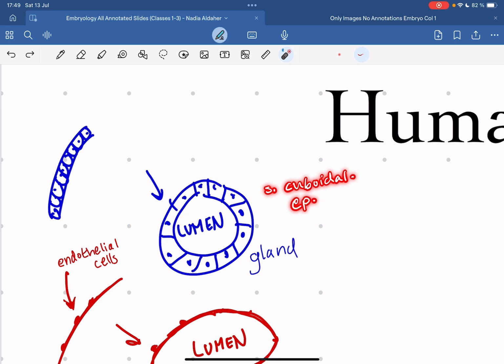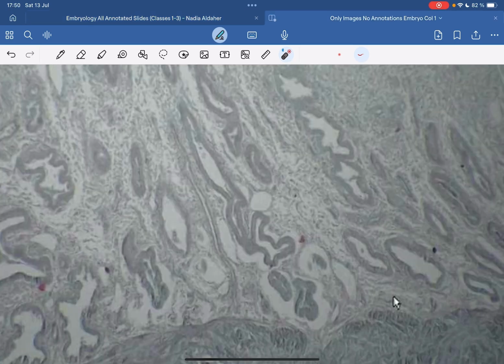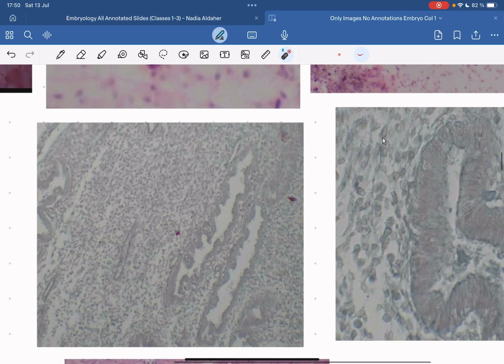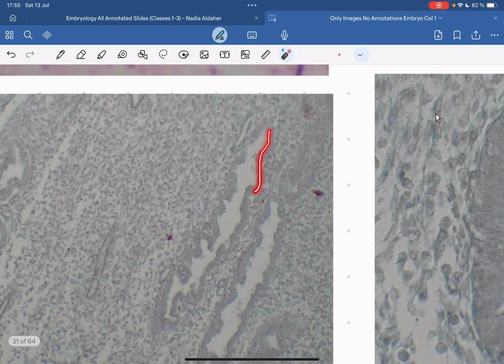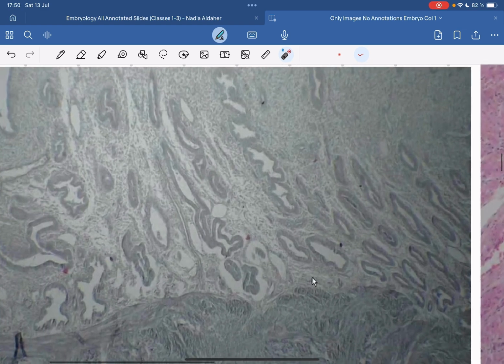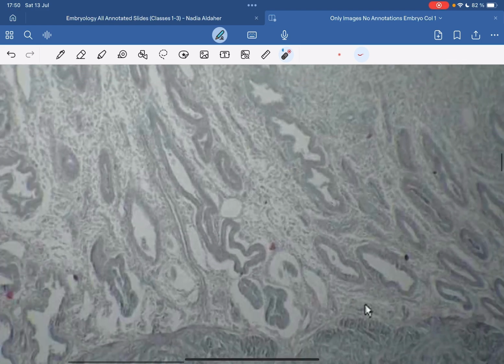epithelium, or glandular epithelium. Now, looking from afar, this glandular epithelium will appear a lot darker like it does here, but zoomed in it will actually look more like this. So these are the simple cuboidal epithelium, and zooming out will make the wall of the glands appear a lot darker, while the blood vessels, which you might see, I think this would be a good blood vessel. See how the walls here are a lot thinner than the walls of this gland, right?